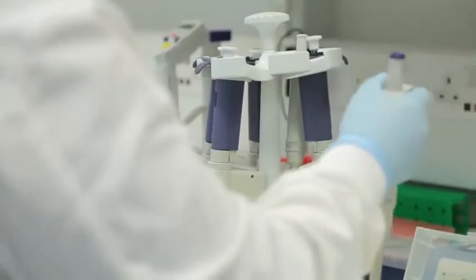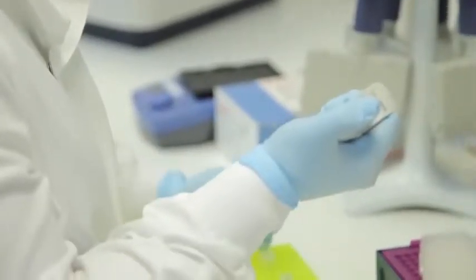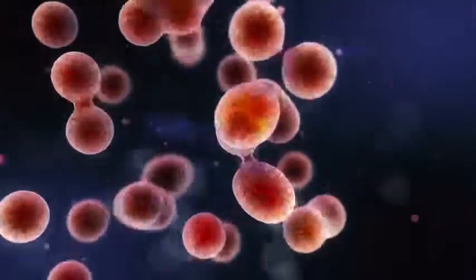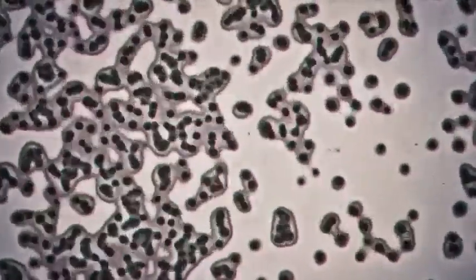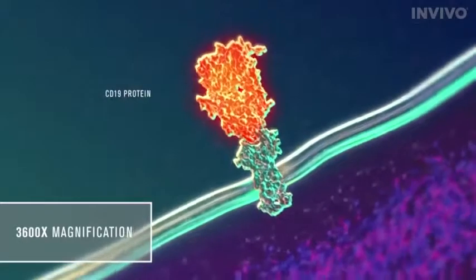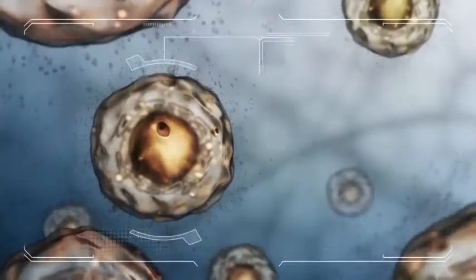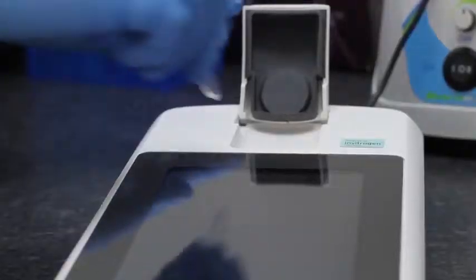GeneWay is a world-class DNA laboratory utilizing cutting-edge technology for genetic testing. GeneWay endeavors to build long-term relationships with our customers, patients and service providers and is dedicated to service excellence by pursuing business through implementing current and expert knowledge, advanced instrumentation and value-added offerings.